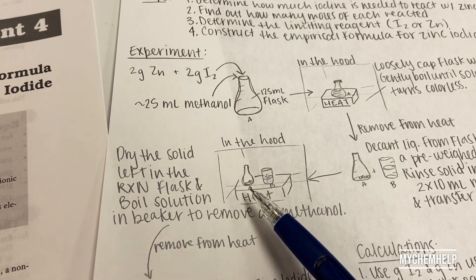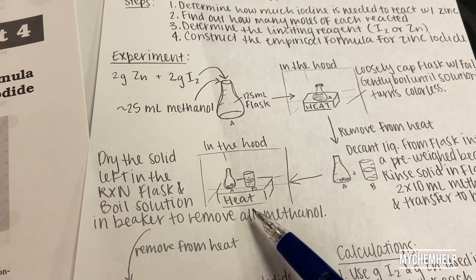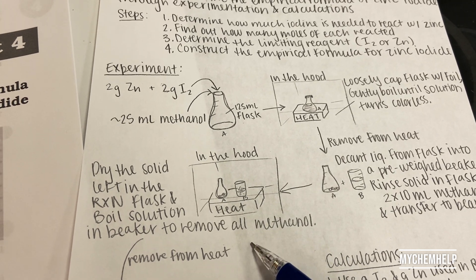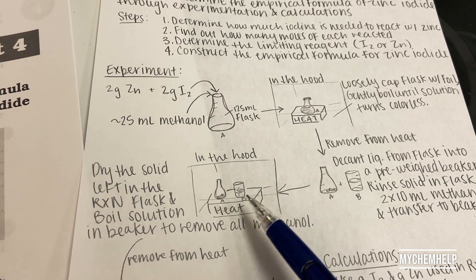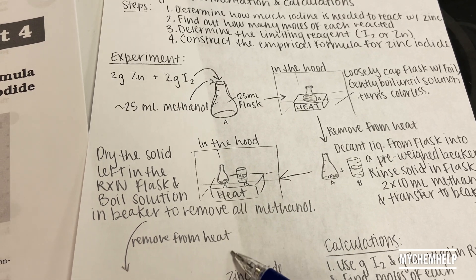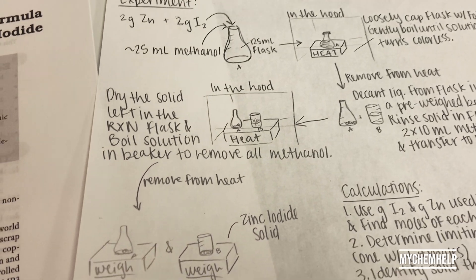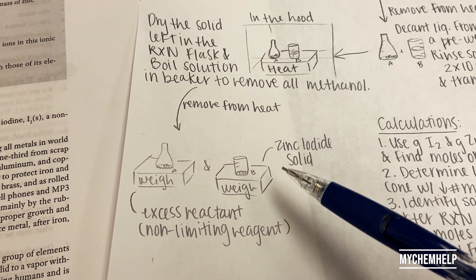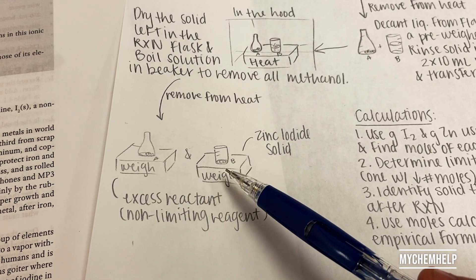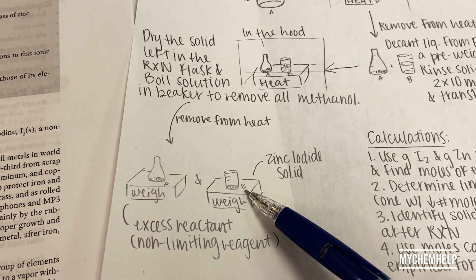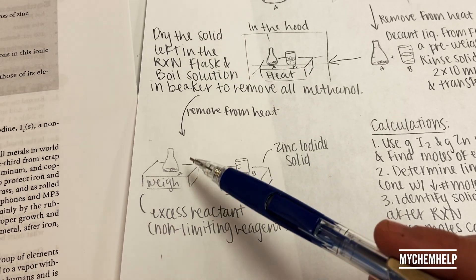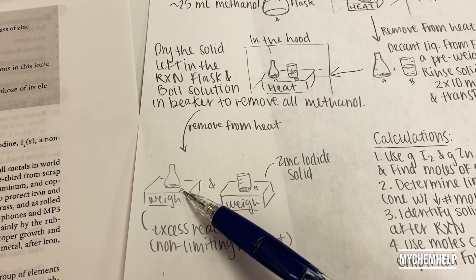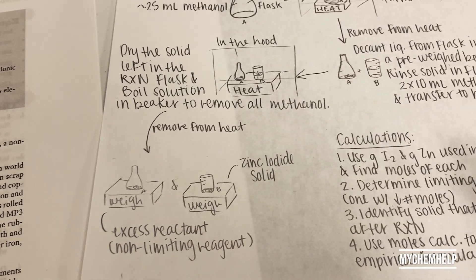Back inside the hood, heat both containers for quite some time to evaporate off all the methanol so we can get an accurate measurement. The zinc solid will be in the beaker labeled B, and the excess reagent is going to be left in the flask.